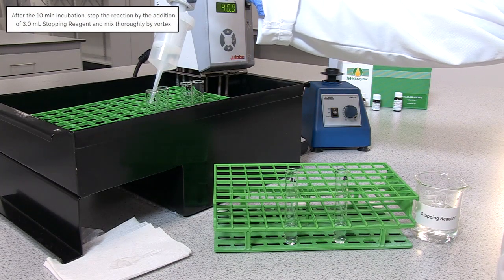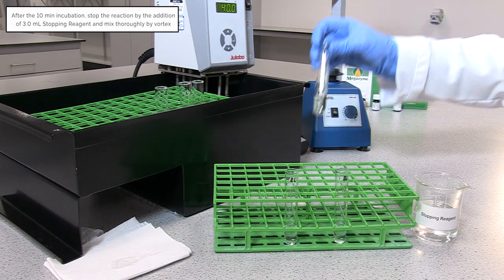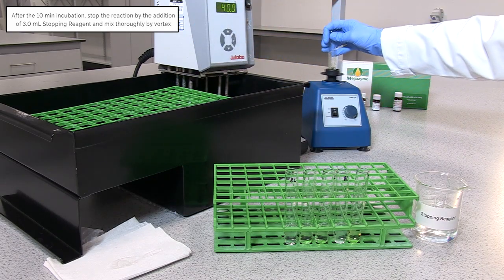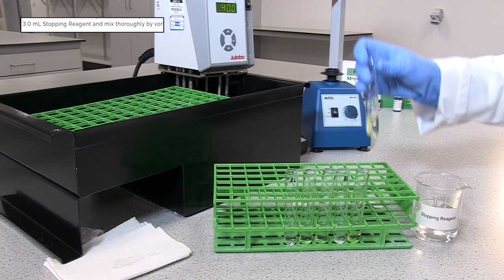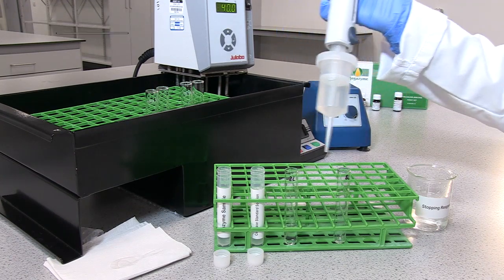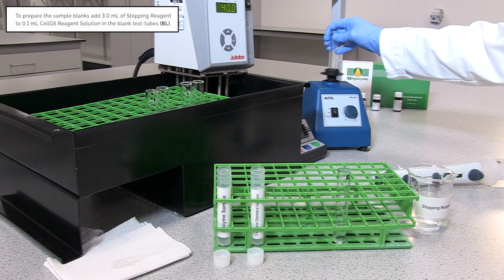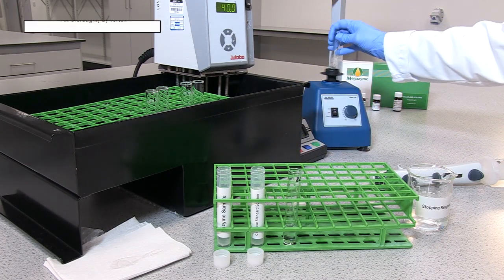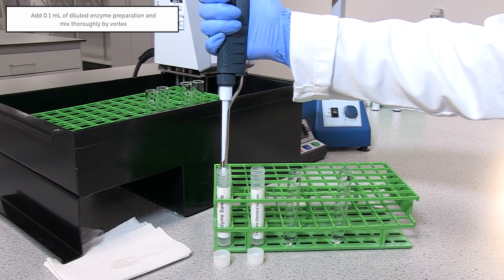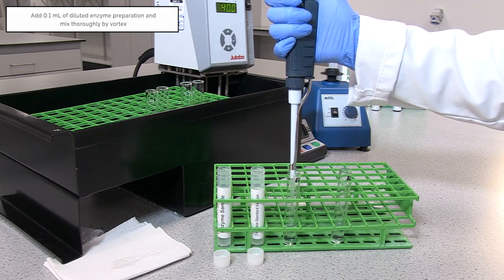At the end of the 10-minute incubation step, stop the reaction by the addition of 3 millilitres of stopping reagent and mix thoroughly by vortex. To prepare sample blanks, add 3.0 millilitres of stopping reagent to 0.1 millilitres of Cell G5 reagent solution and mix thoroughly by vortex. Add 0.1 millilitres of diluted enzyme preparation and mix thoroughly by vortex.